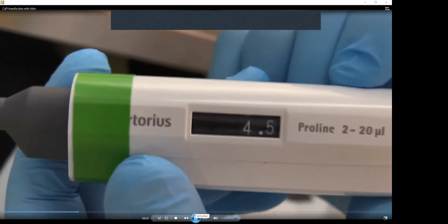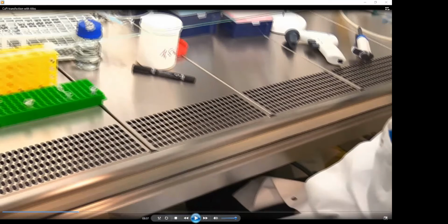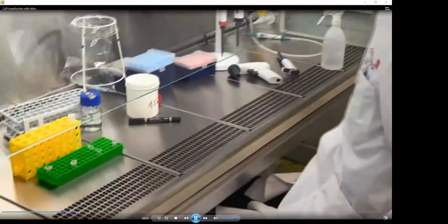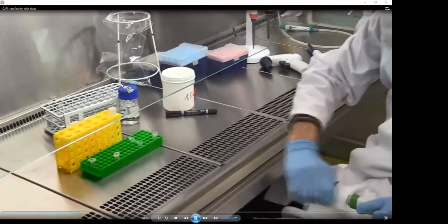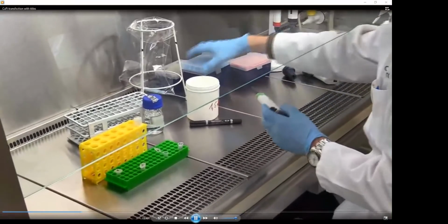So 4.5 microliters is therefore not 4.2 because this pipette you cannot adjust on 4.2, so slightly more DNA top flash. Top flash is the reporter. So always clean the pipette, as I told you, because this is the next pipette for small volumes.